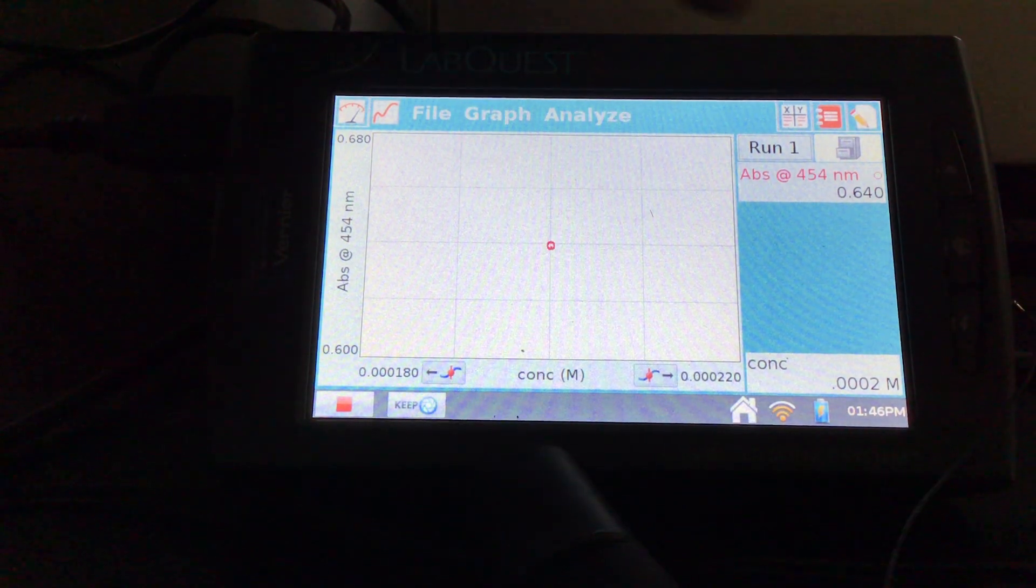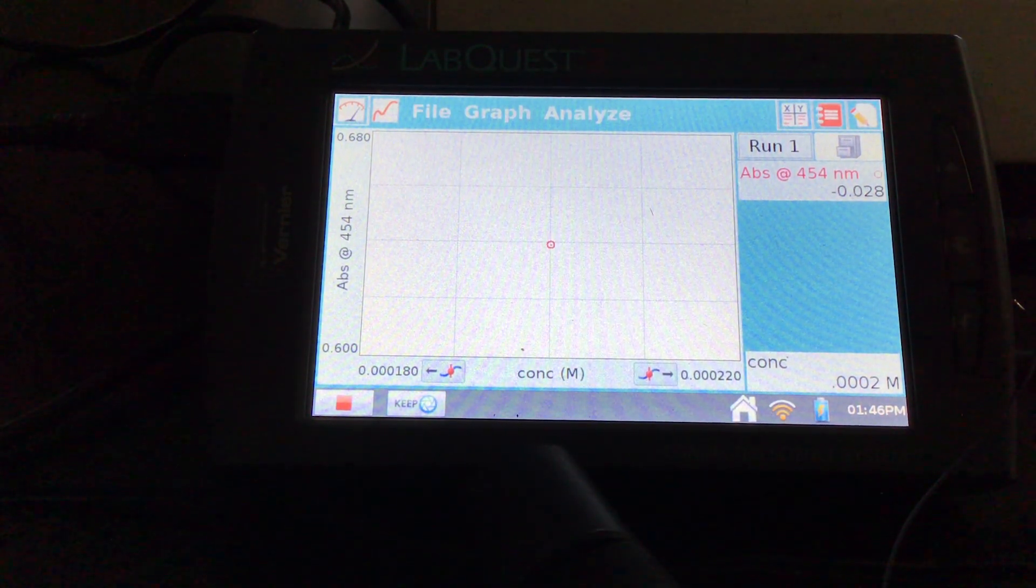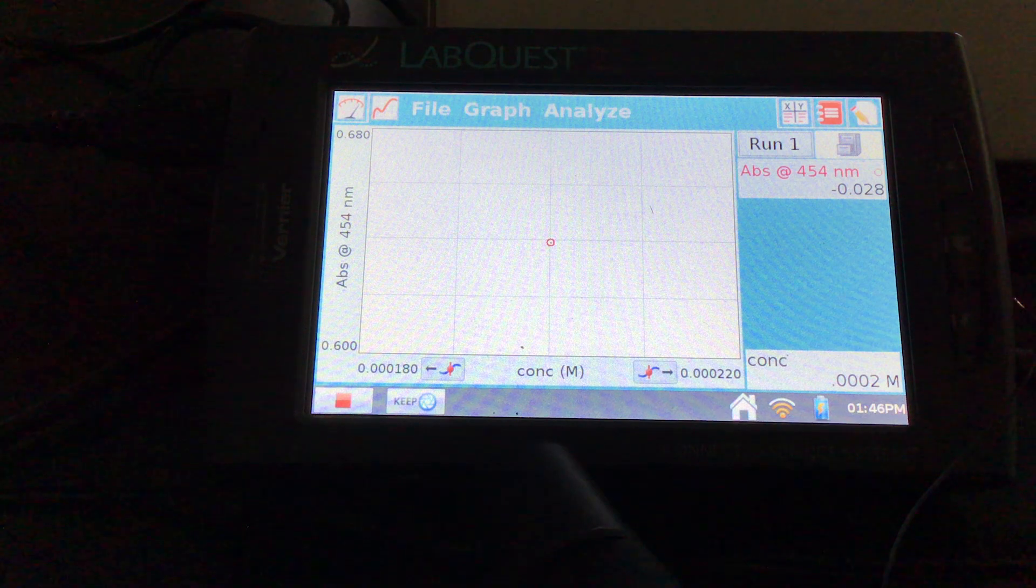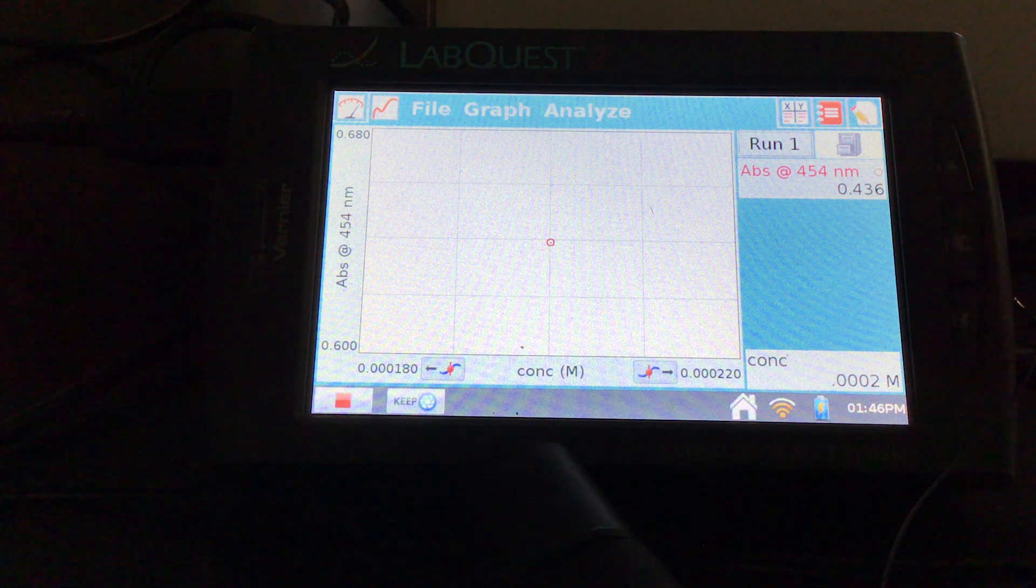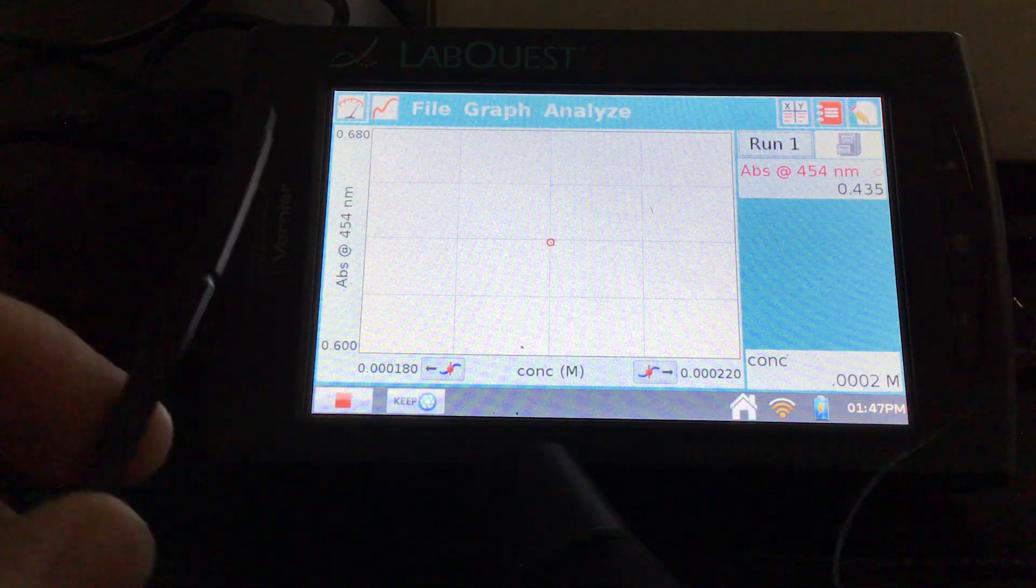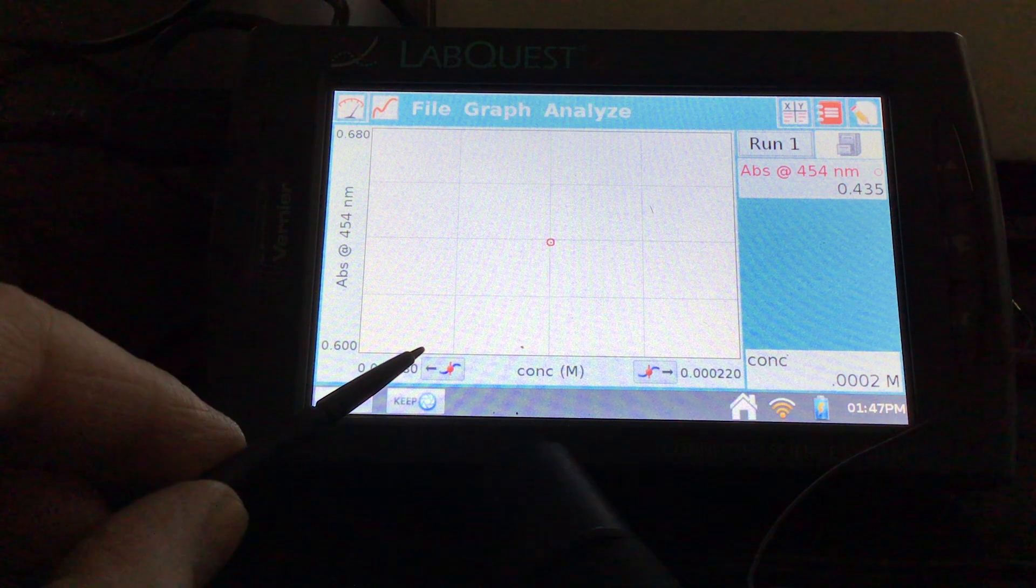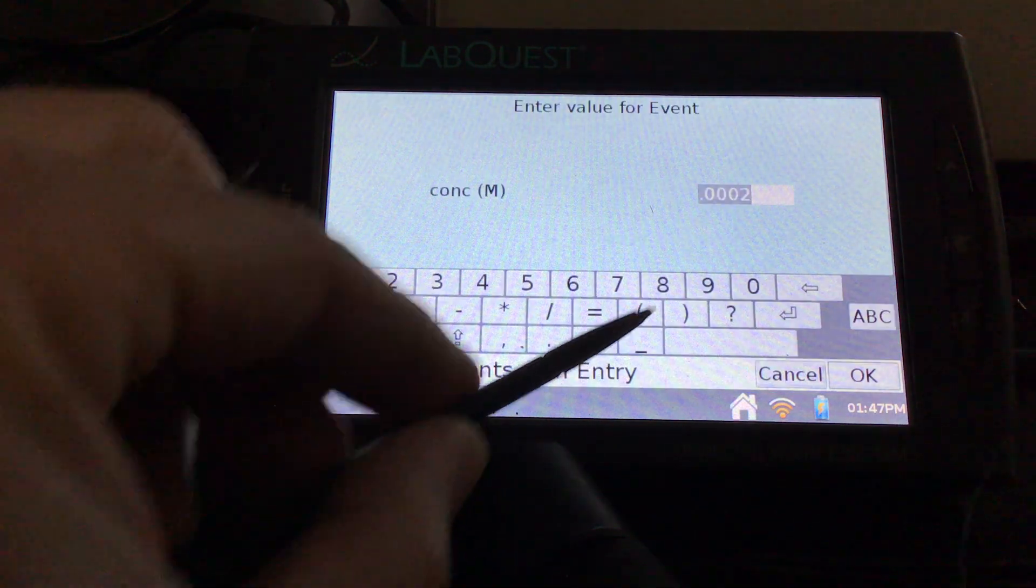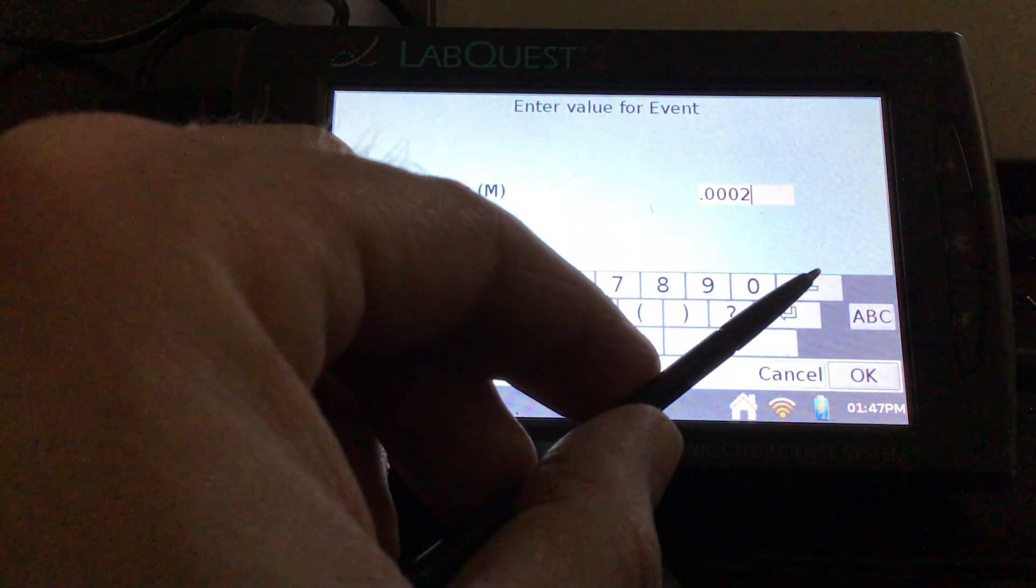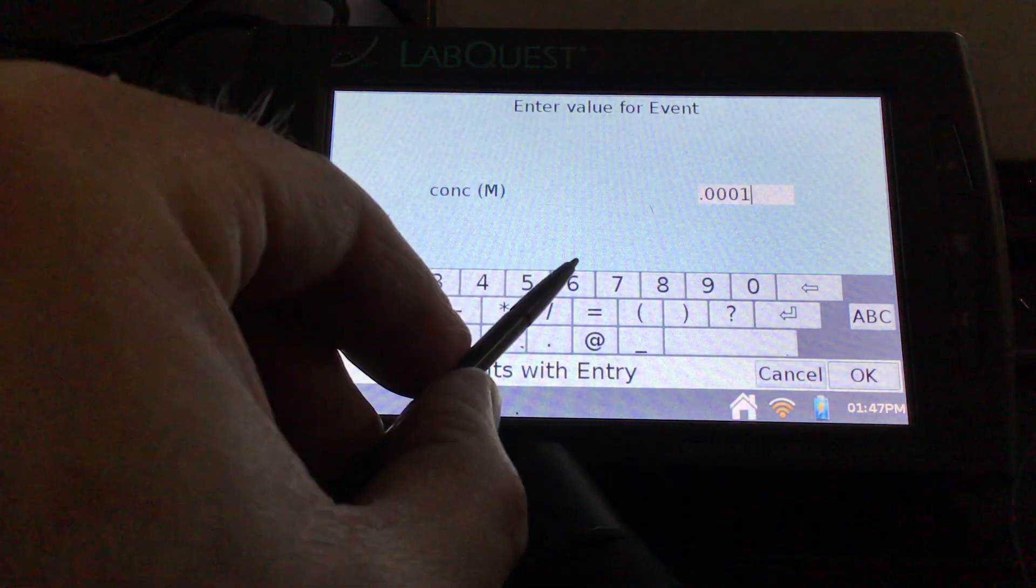And then I'll start switching it out for the other cuvettes, the other standards, keep entering them in there. Once I see my absorbance stabilize, then we'll start keeping our data. And you can always adjust and maybe strike through a data point if you need to. So I'm going to hit keep. And then my concentration for this one is 1.6 times 10 to the negative 4th. So three zeros, and then the 1.6.